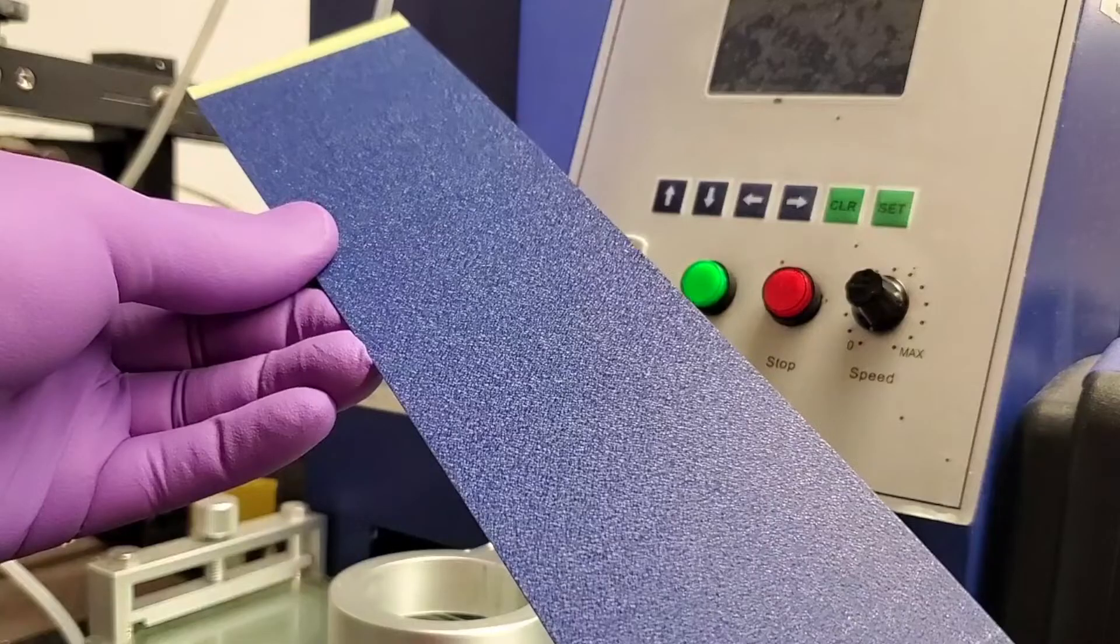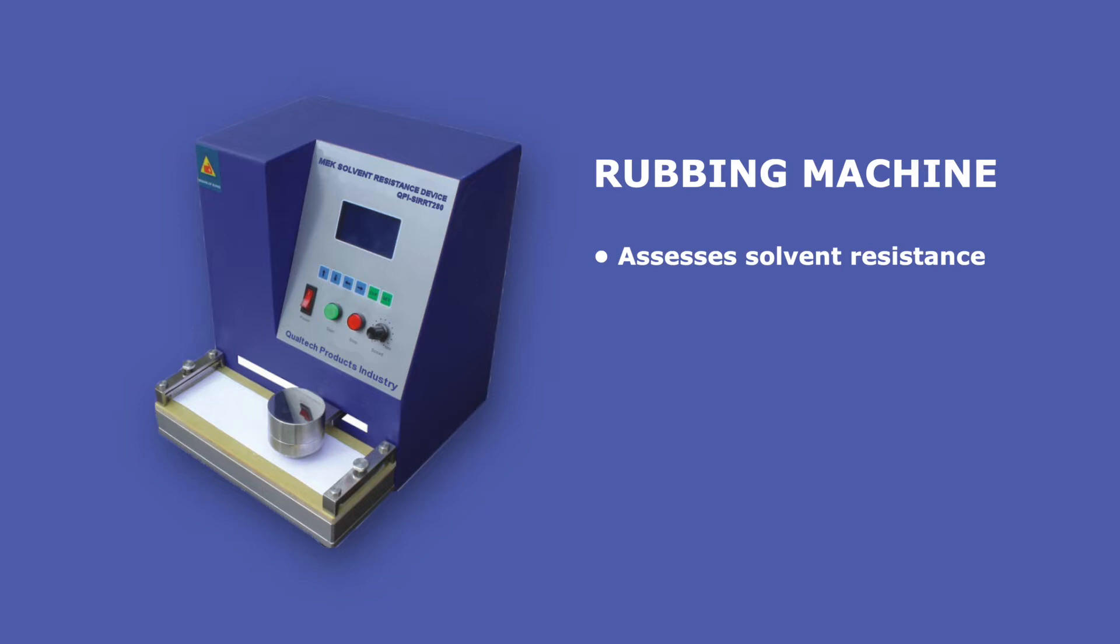Rubbing a cured coating with a cloth saturated with an appropriate solvent is one way to determine whether a proper level of cure is reached. In this video, a mechanical rubbing machine for assessing the solvent resistance of an organic coating is used.